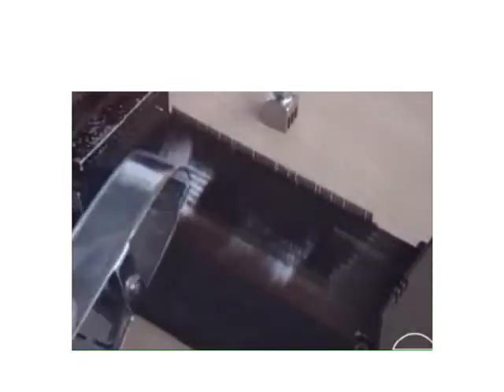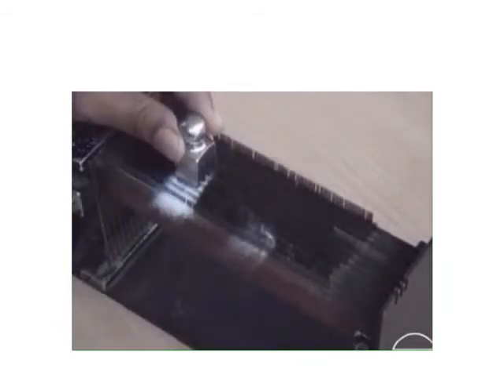Similarly, all the fibers are pulled and the short fibers that are combed nearby in the bottom comb are placed on the left hand side as shown in this video. Similarly, all the fibers are pulled and transferred to the left hand side. The purpose of this is to make the starting position of all the fibers the same. Earlier, the fibers started from different positions. Now, all the fibers start from the last comb.